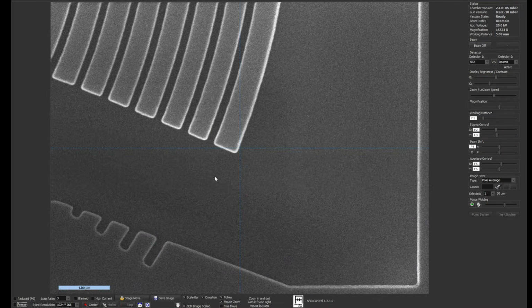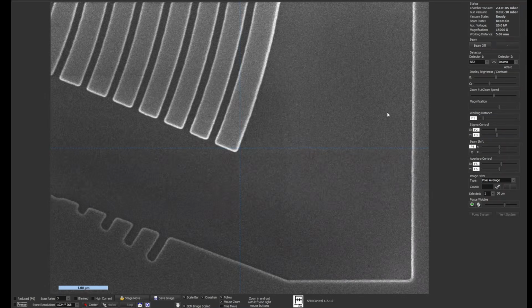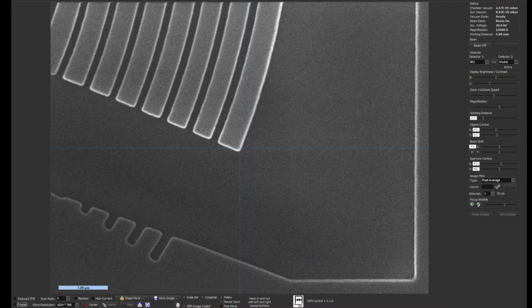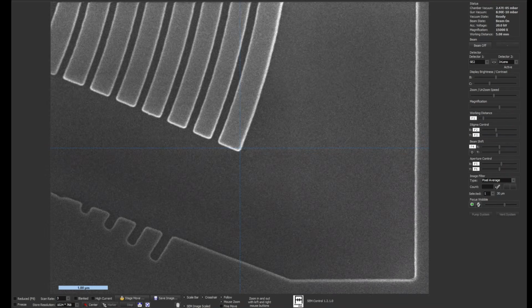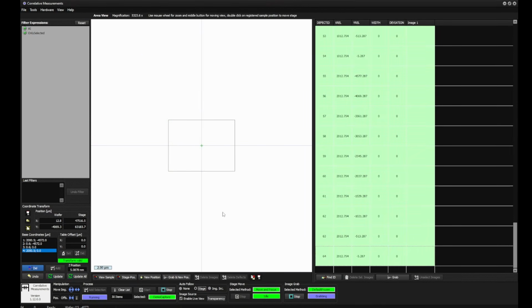And we want, maybe we go to 15K, like that, and have this here in the center. Good. The contrast and brightness settings are okay. So let's update the demo image. Now let's start the capturing process. We are here now.